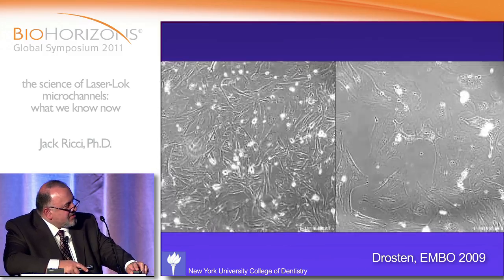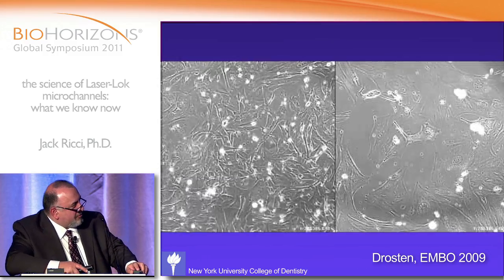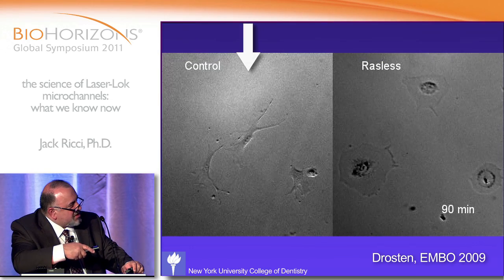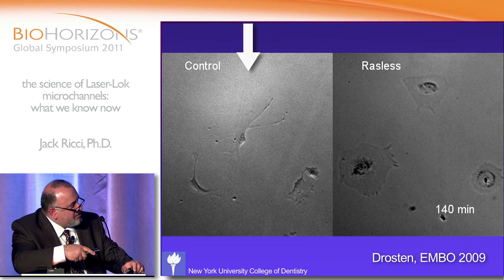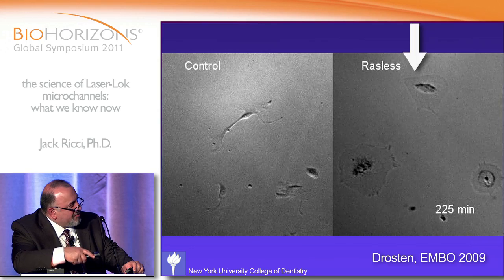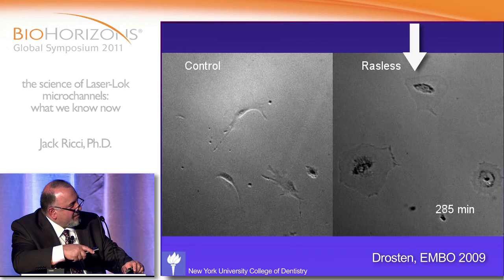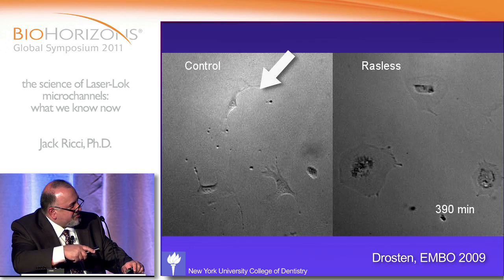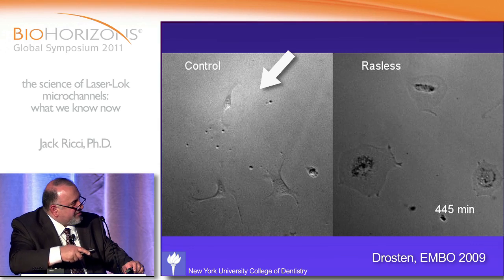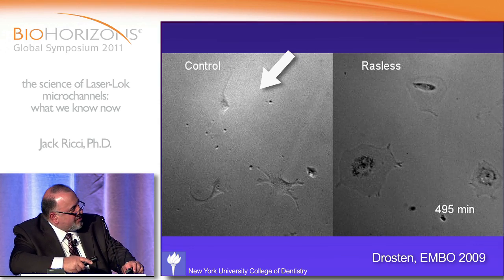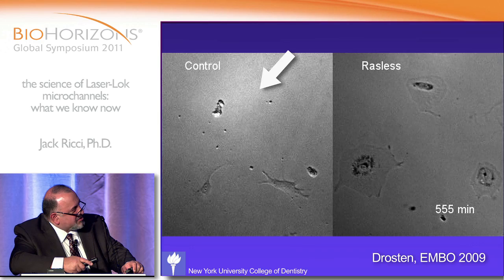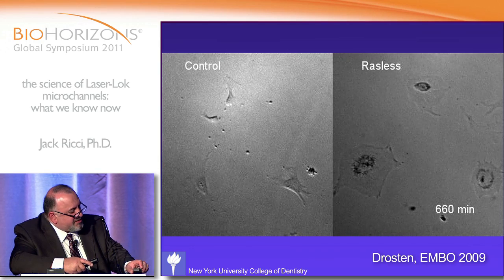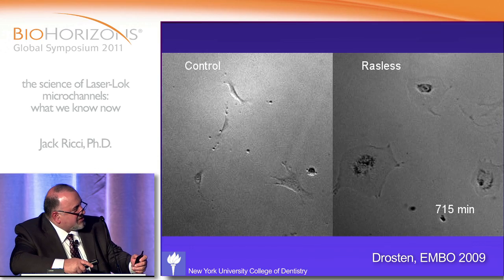If you look at cells on an individual level, you can see these cells are migrating and they're sort of doing a random walk. These cells are not migrating at all because they've had the Rac knocked out of them. Essentially this cell is going to undergo cell proliferation — you'll see it round up and split into two daughter cells, and the two cells migrate away. That's very typical cell behavior on a flat surface.